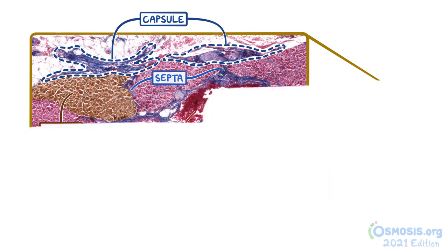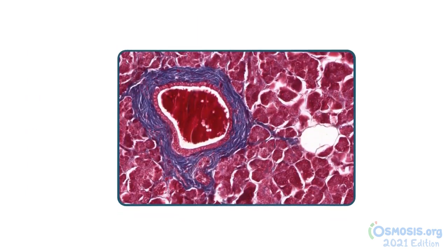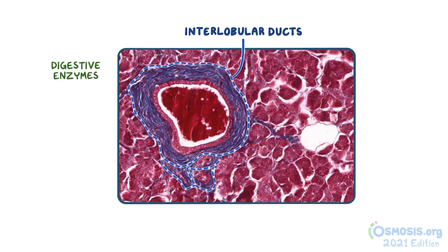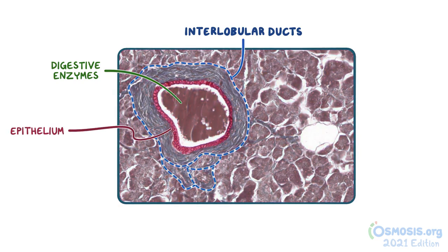Azin stain will also stain the connective tissue surrounding the interlobular ducts a similar color, but these ducts can be differentiated from the blood vessels by the presence of digestive enzymes instead of red blood cells within their lumen, as well as their distinct epithelium that lines the lumen.